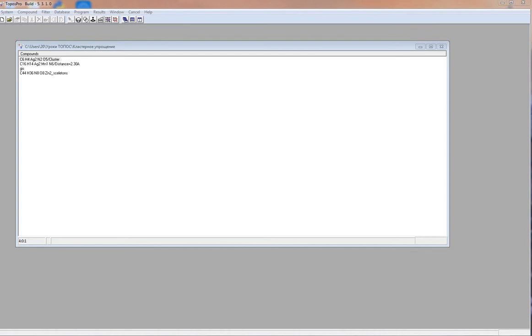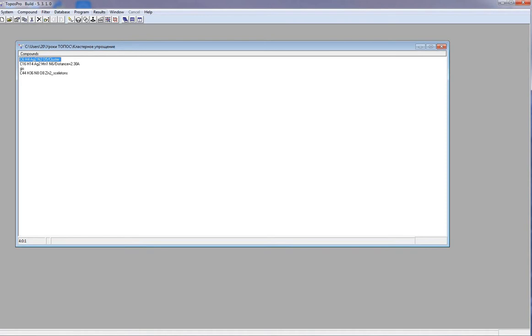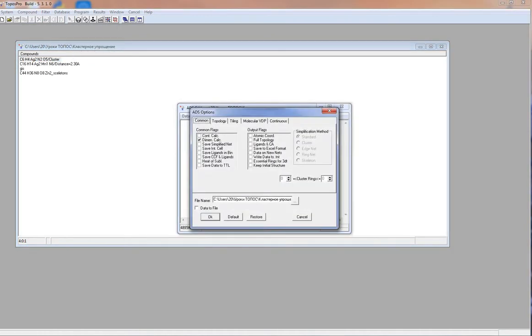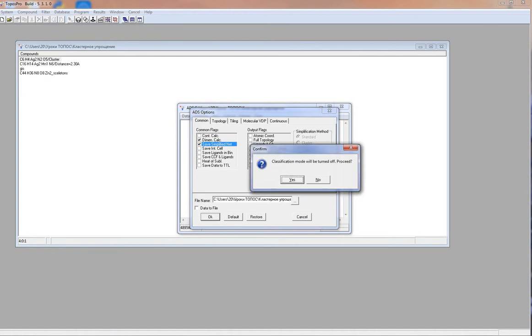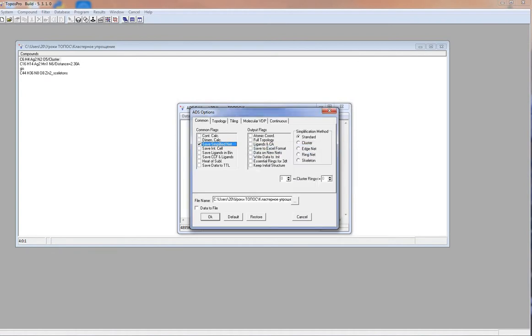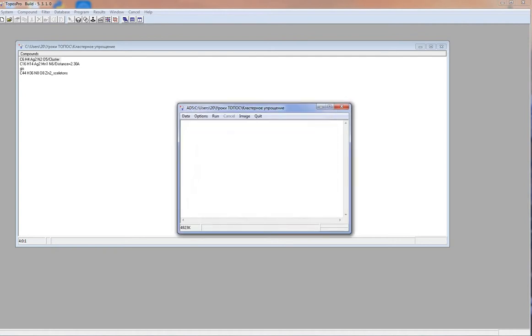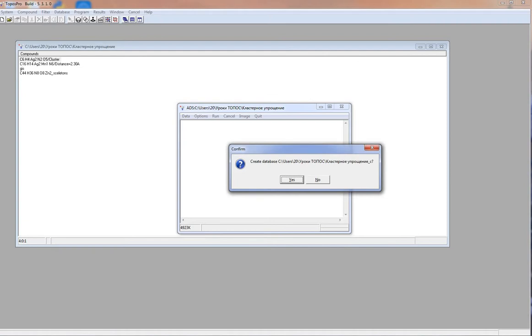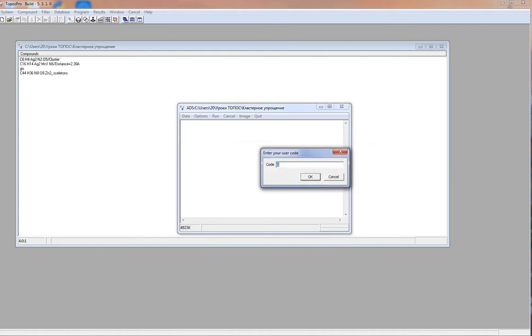I select the compound, run ADS, options tab common and mark option save simplified net and choose cluster simplification method. Topos offers to create new database for the simplified structure. I use code 1.